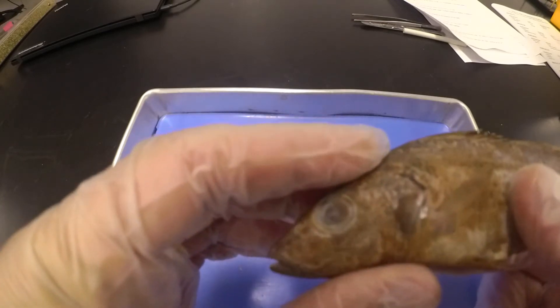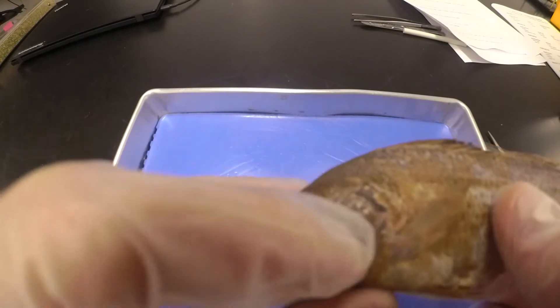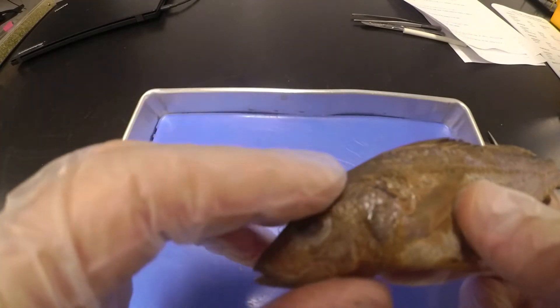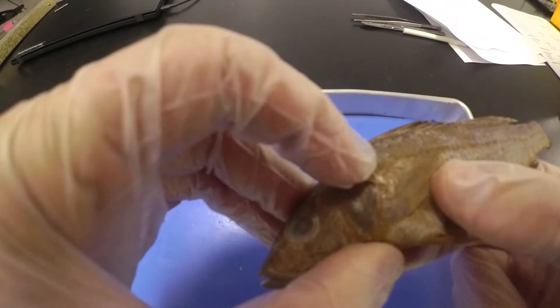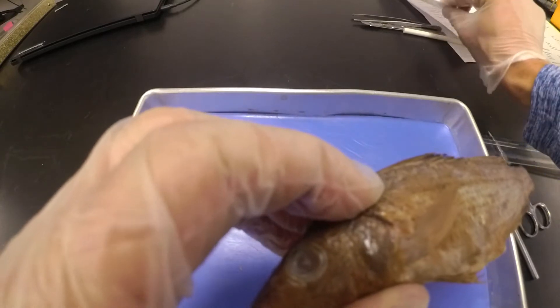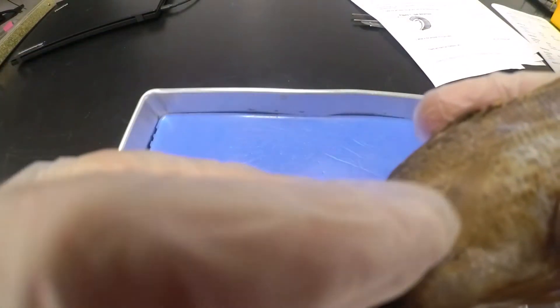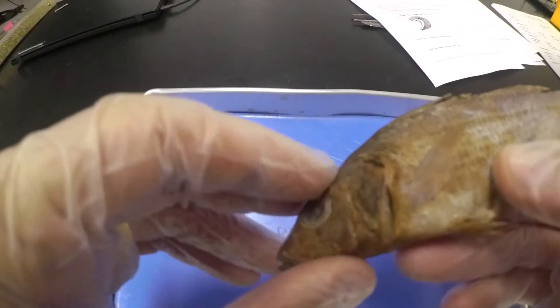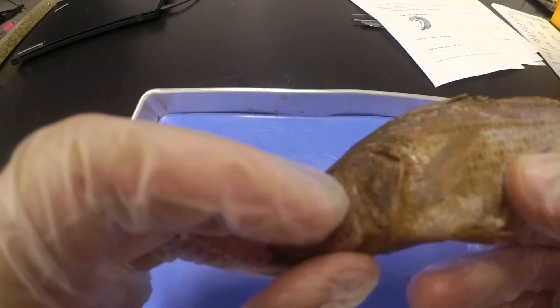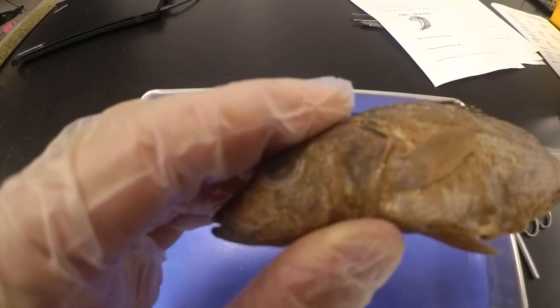Then on the front we have this covering protecting the gills. It's called an operculum. It can be a little sharp if you're not careful with it — it's got this bony covering called an operculum. If we lift it up, you can kind of see inside to the gills. In the next step, I'm just going to pause the video and cut that operculum off so we can see those gills a little bit better.